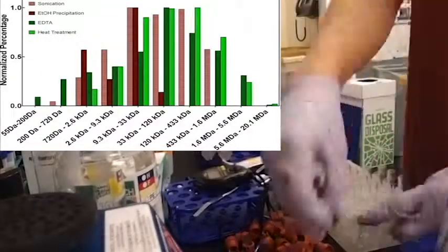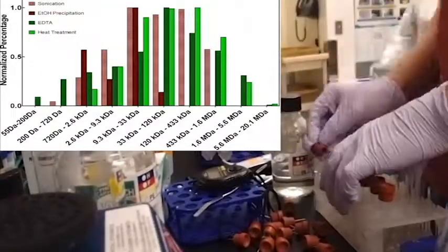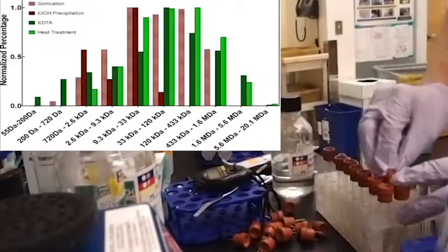This graph shows the molecular weight distribution for each protocol. Without going into detail, you can see that there are significant differences between each protocol.